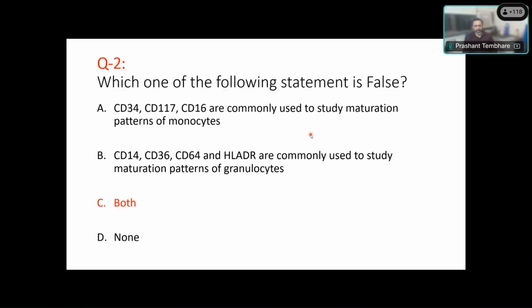This is a well established categorization. It has been studied in depth for the last 30 years, but in the last 5 or 10 years, people have studied them for defining and classifying diseases like this. Like CMML, they have shown that if you take 100 cases of CMML, more than 96-97% of cases will have this typical restriction of classical monocytes, in more than 94%. There is a group from France, there is a group from the US, and we have also validated all these findings in our lab.